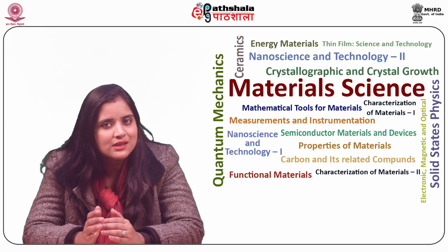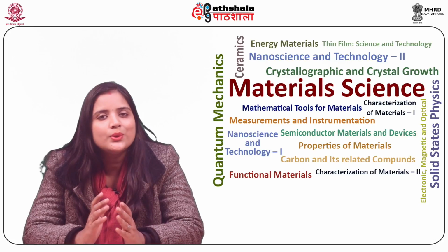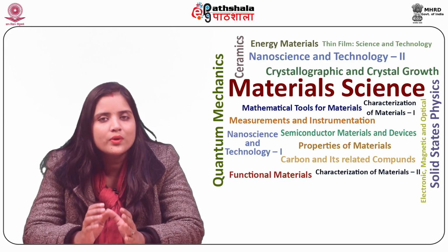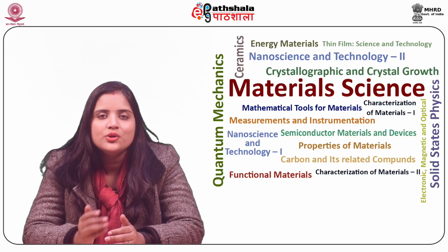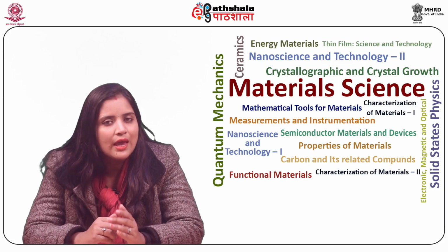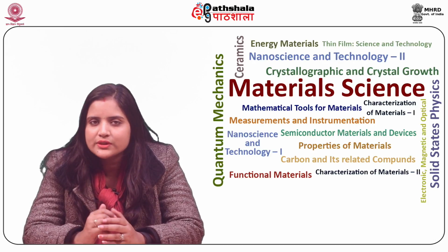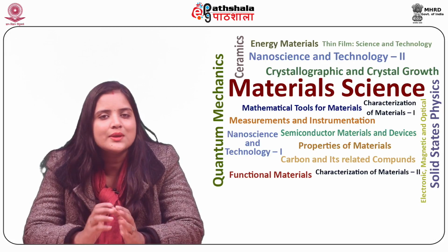Spot chemical analysis can be obtained in situ, which allows the user to detect even small compositional variations within textural context or within chemically zoned materials. Electron probes usually employ an array of imaging detectors, that is SEI, BSE, and CL, for creating images of the surface and internal compositional structures to help with investigations.